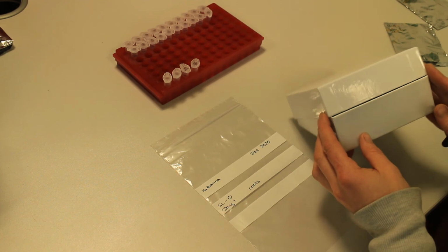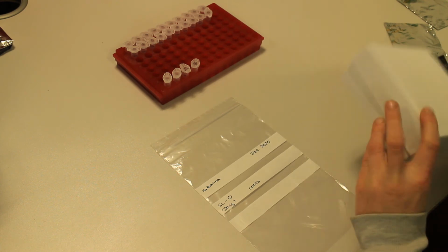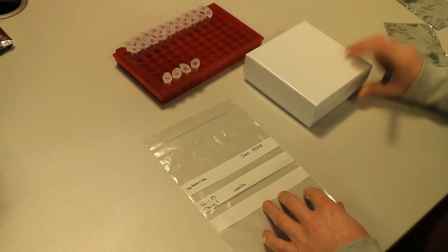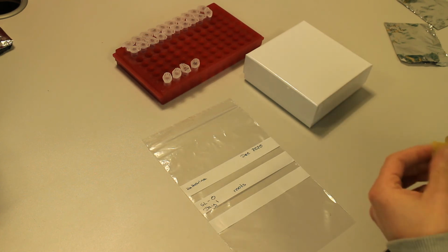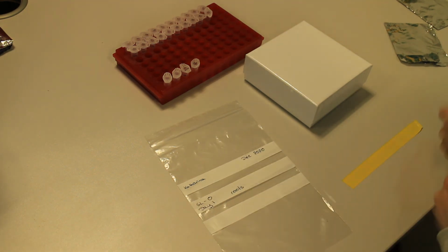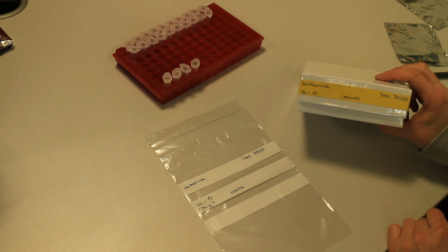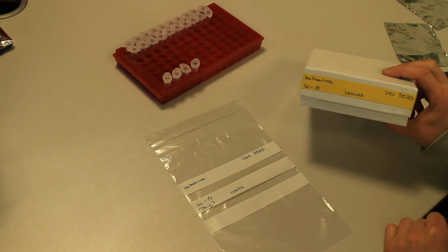For these boxes, they are usually kept in rack storage. So if you label them from the top or from the side, actually depends on how your lab stores them. We store them in little racks, so you would see the sides. And for me to find my own samples a bit easier, I decided I'm going to use this yellow isolation tape. And then I know, and everybody else knows what's in there without opening the box. And if they don't need to open the box, samples won't fly around as much.